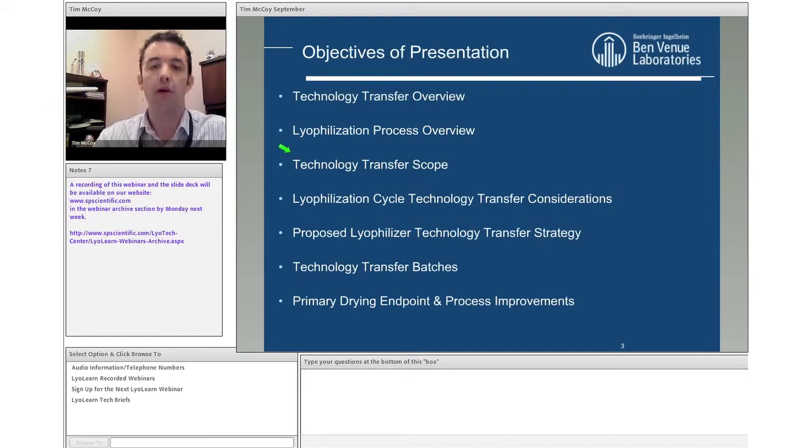After which we will talk about freeze-drying, both product and system considerations, and then we'll talk about freezing and primary drying independently of each other, and what the gaps are, what the areas of concern are, and what options are out there to improve tech transfer to make it, I suppose, less risk and more improved confidence.